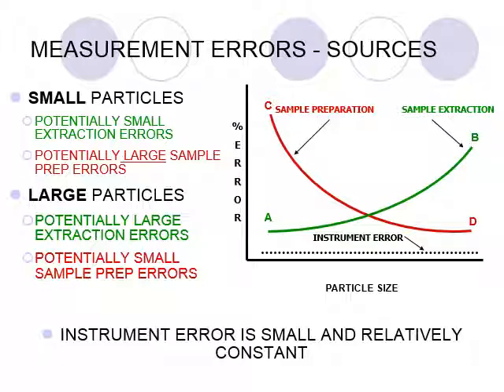Your errors in particle size measurement, by that I mean getting a measurement that truly represents your system, occur for how do you sample something, and then how do you prepare the sample. In terms of sampling, which here is labeled as extraction, how do you get a representative, proper sample out from your population of material? If you're testing for a rail car that you're buying of a raw product for your system, during the traveling on the train, something like a rail car of material, that's enough vibration where you'll shake all the larger things down. You will settle like sugar and salt when you shake them apart.